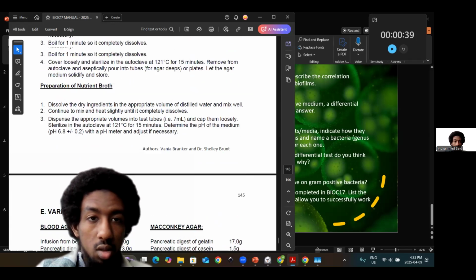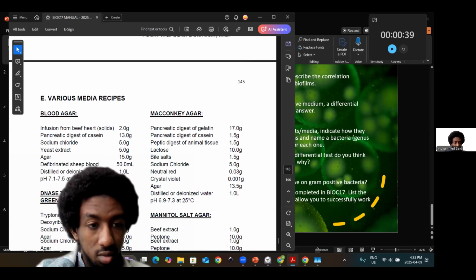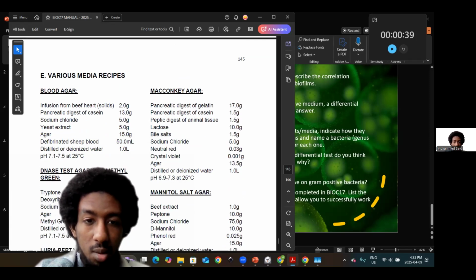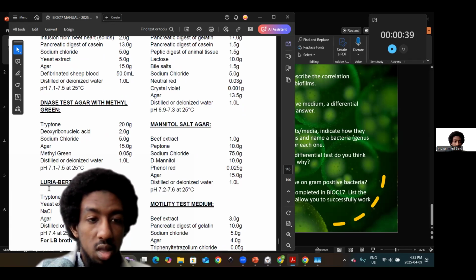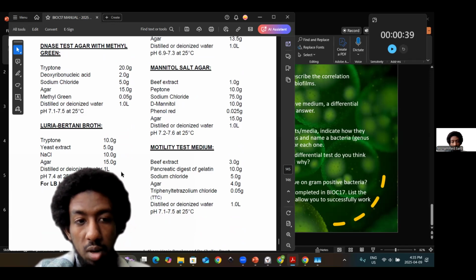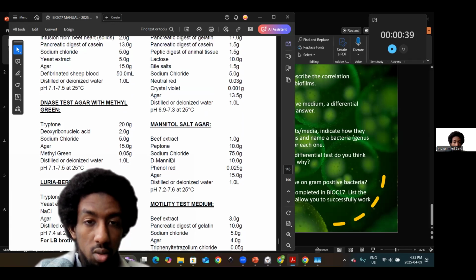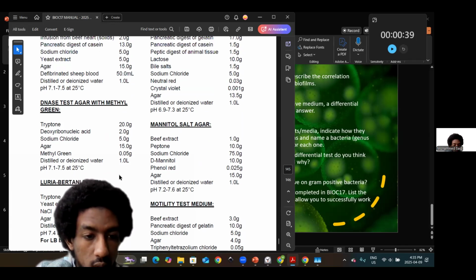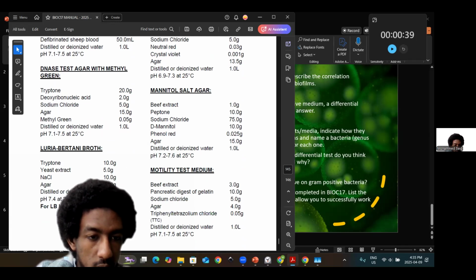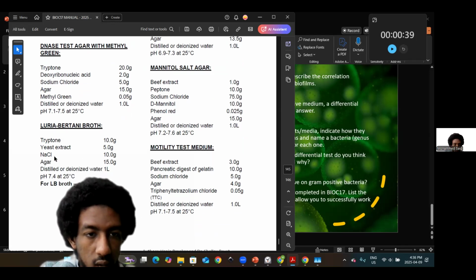It's very important to understand that the right conditions are met, with aseptic technique even for the broths themselves, right? That way you don't run the risk of any contaminants, even bacteria. So this is the Luria-Bertani LB broth that we often use, and you can make note of the different other media or agars that we've been using. You'd omit the agar in the case of just the broth itself, but with the LB agar plates, that's where you have the agar included.